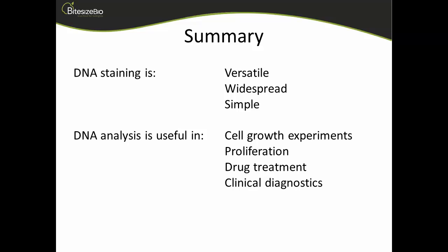Our next question is, how would you best optimize the vital dye concentration, time and temperature of incubation prior to the experiment? So I guess, a question about optimization. Yes, I suppose that's relatively straightforward. You'd set up the same sort of thing you'd set up for titration of an antibody. So we'd set up various tubes with different concentrations of the dye, incubate them at the appropriate temperature, whether that's room temperature or 37, and sample at different time points.